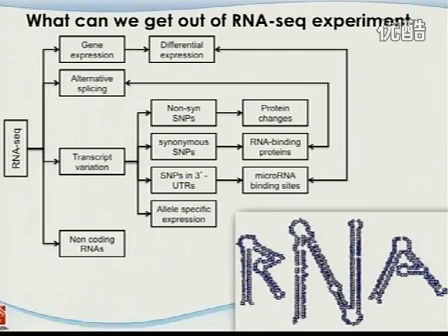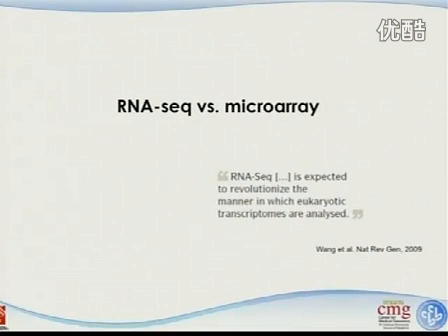So it's really hard to study on the global scale. But with an RNA sequencing experiment, you can certainly do that. Now I'm going to use a couple of slides to briefly compare RNA sequencing versus microarrays. None of these studies was done by me. We did have experience, but these are data from other people.